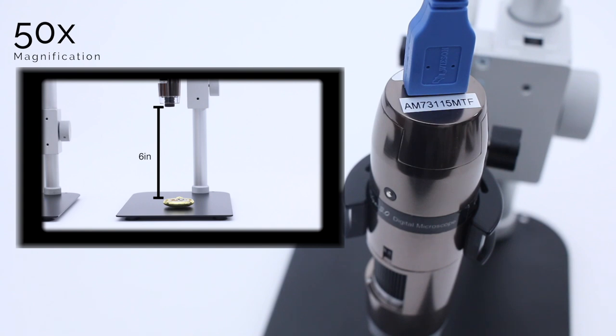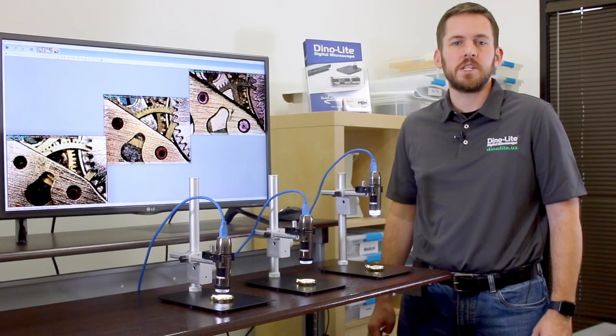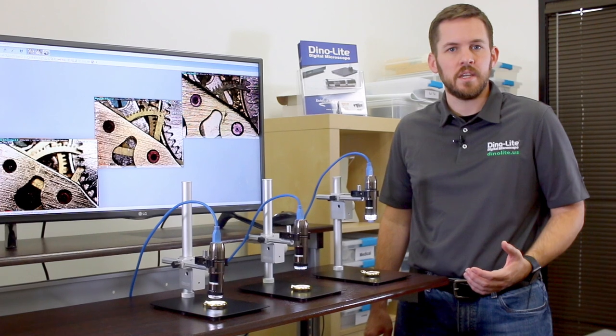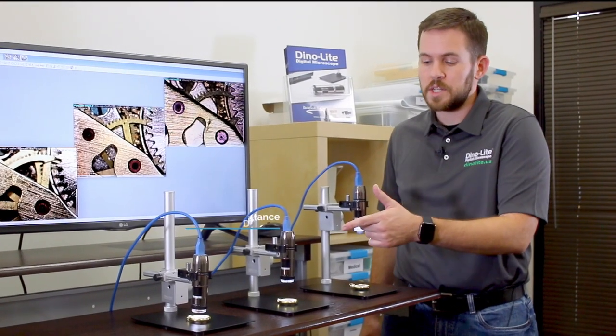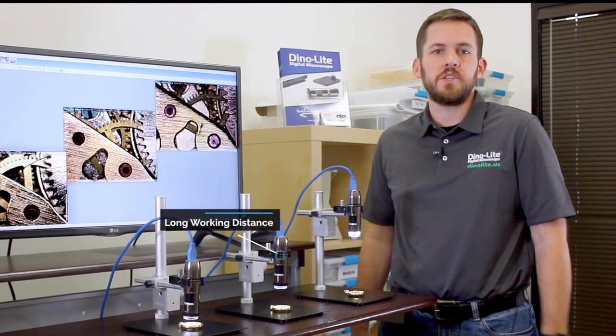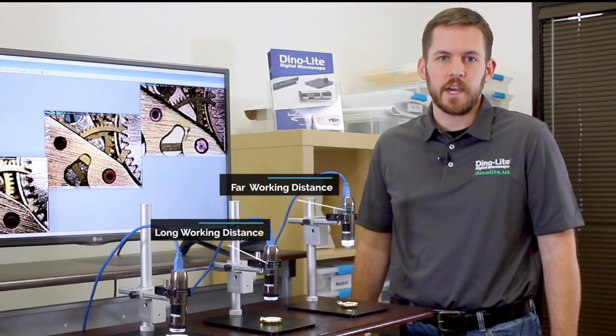Please keep in mind there is a trade-off for this extra distance. These working distance models are not able to provide as much magnification as our standard design which can do over 220x. For example, the long working distance model here maxes out at just over 140x and the far working distance style caps out at over 70x.